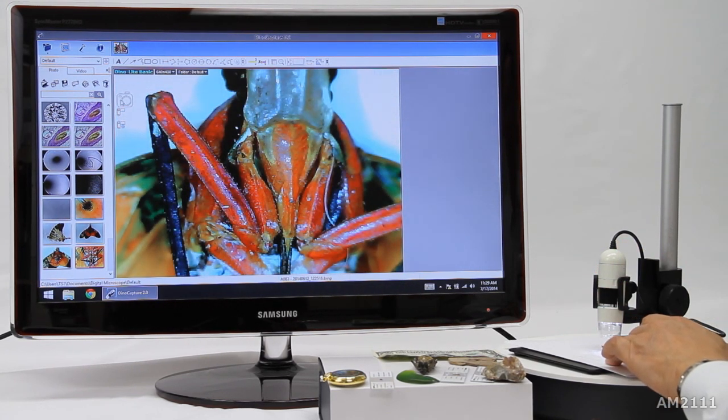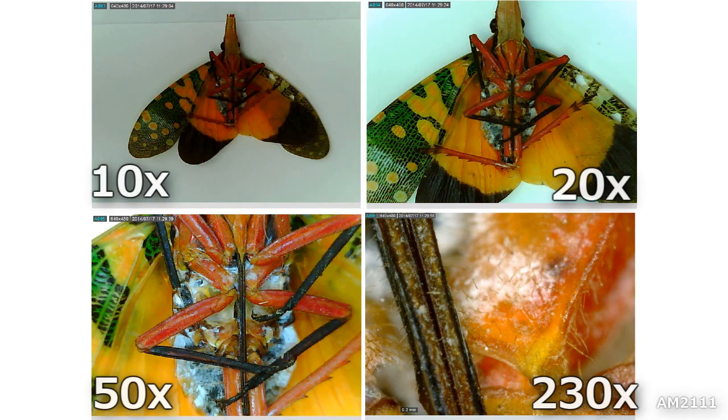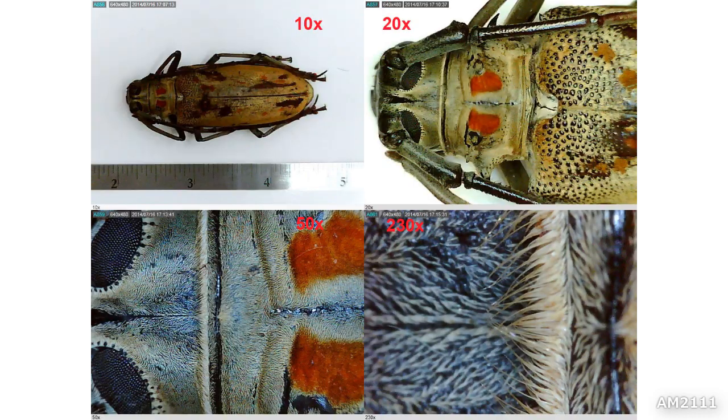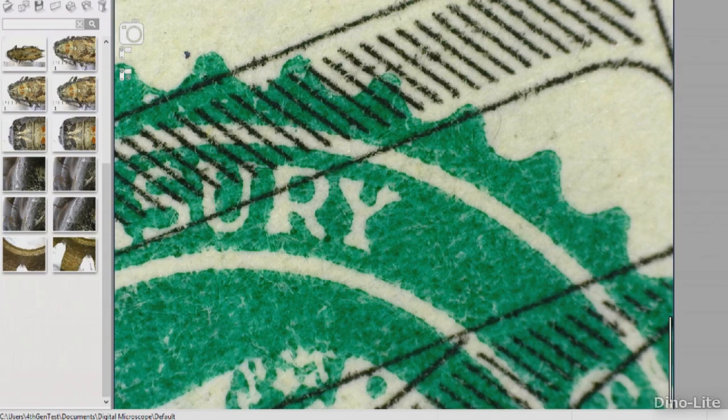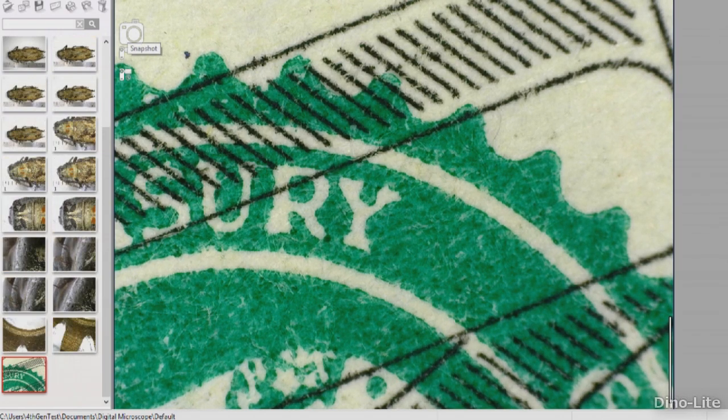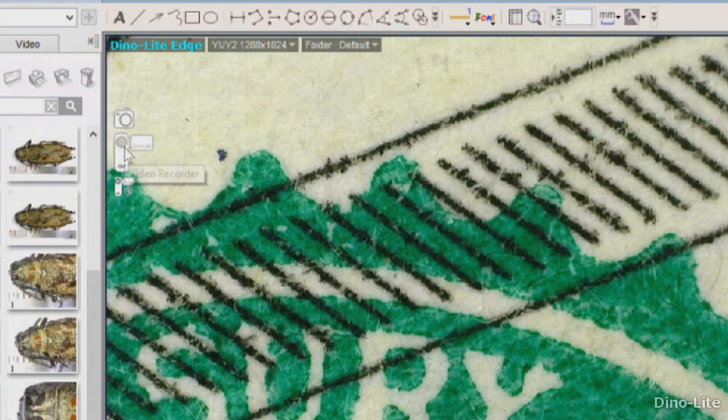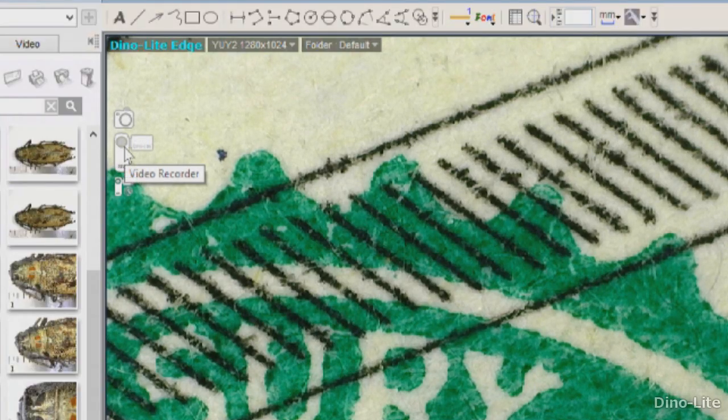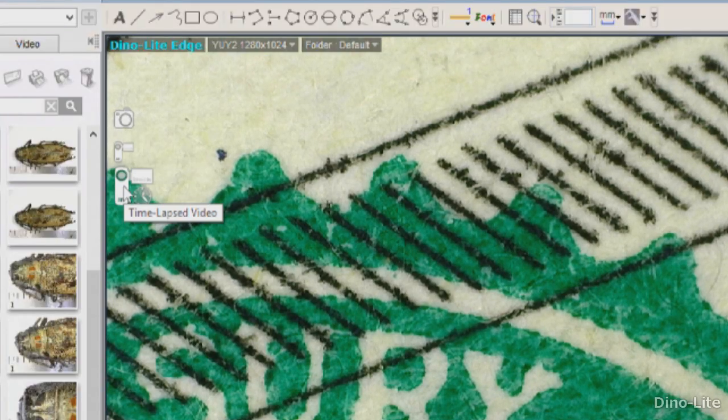Here are the images that were taken at different heights and magnification. Click on the camera icon to capture an image. Below is the video and last is the time-lapse video.